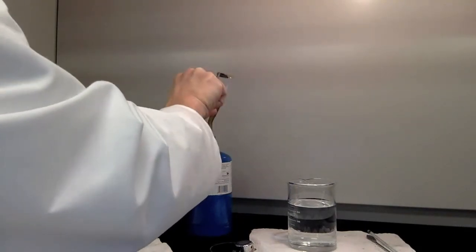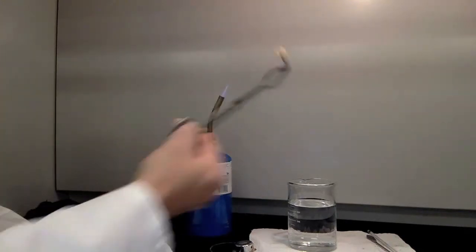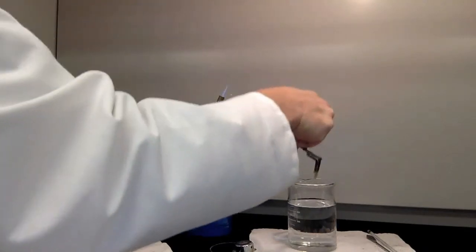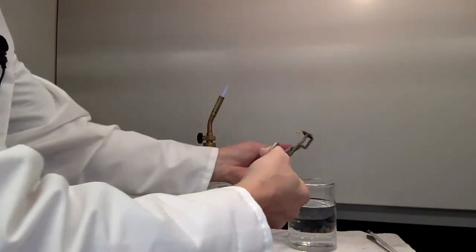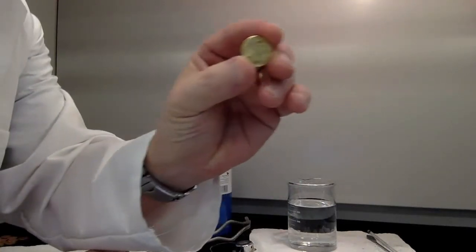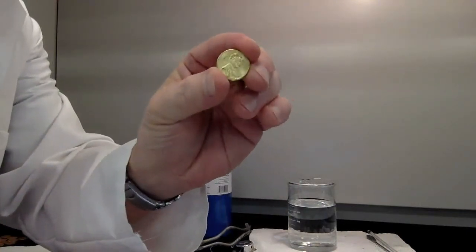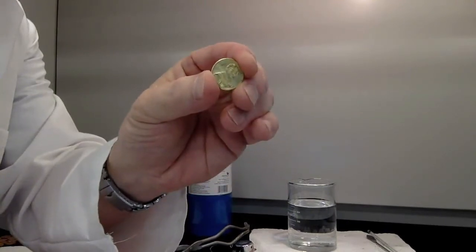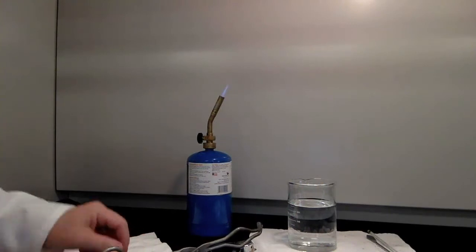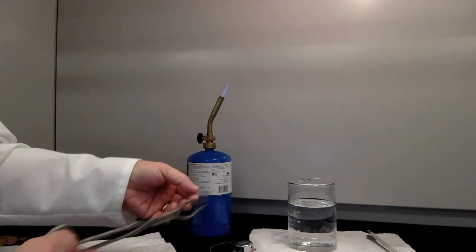When it begins to change color, like so, I'm going to dunk it in here, into this water, and it's going to cool it off rather quickly. But notice now, we have our gold penny. So we've had a blending of that copper and zinc layer to give us this gold coloration. And I've got two more pennies I'm going to do this with just to make sure.